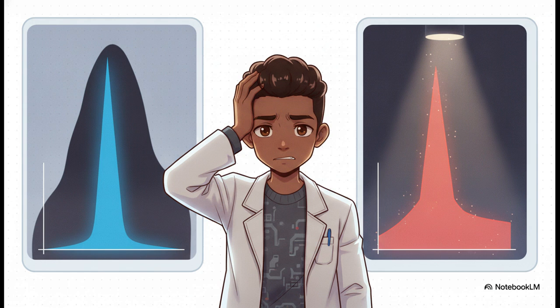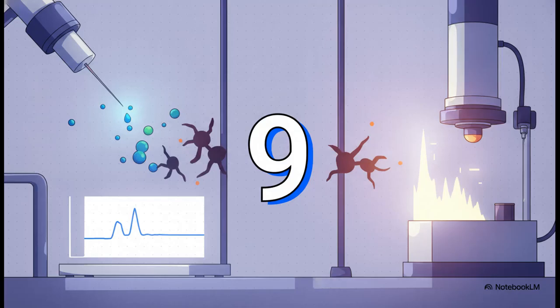On the flip side, formic acid, or FA, produces slightly wider peaks, but as we're about to see, it plays way nicer with the detector. The impact of this choice? It's staggering. When you're using electrospray ionization mass spectrometry, adding TFA causes a massive 9-fold suppression of the mass spec signal compared to using formic acid. 9-fold! TFA is such a strong ion pairing agent that it literally hides the molecules from the detector.